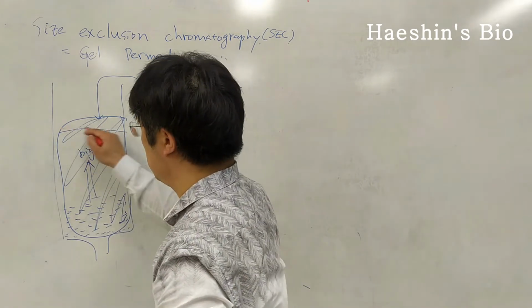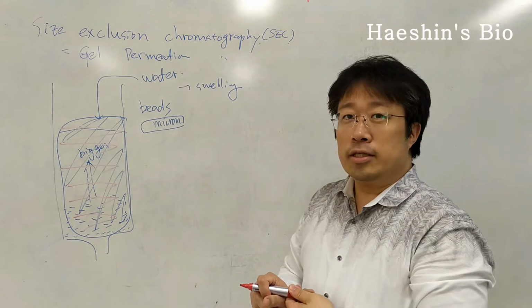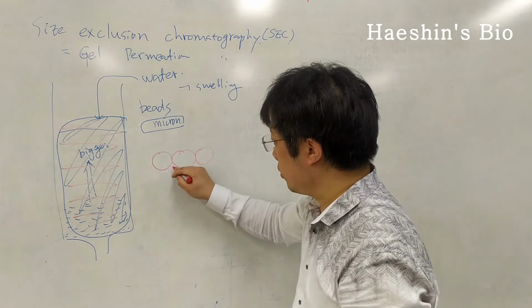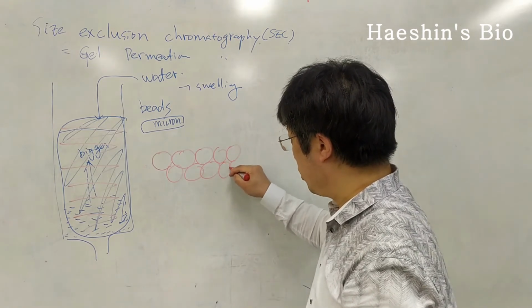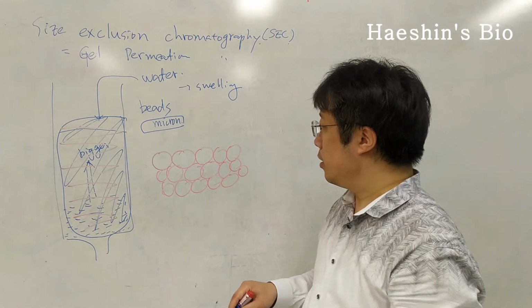Basically, I can describe the situation in which the individual beads are packed really well this way.